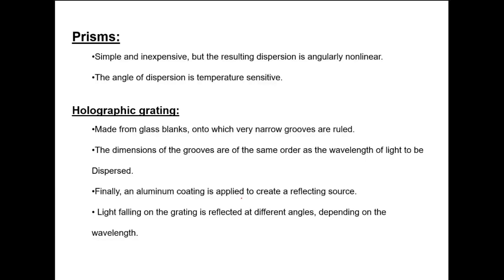In the olden days we used prisms. Now the prism has been replaced almost completely by the holographic grating concept. The advantage is that the light falling on the grating is reflected at different angles depending on the wavelength of light, which can be captured by the detector. So the sensitivity of the holographic grating mechanism is very high, powerful compared to prisms.